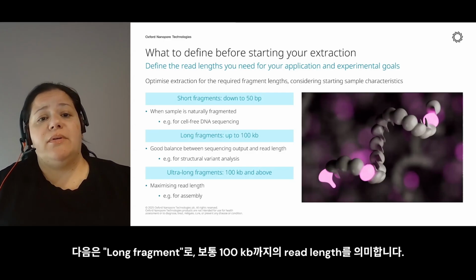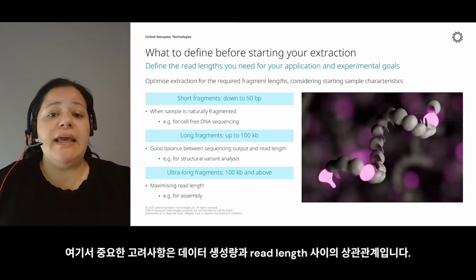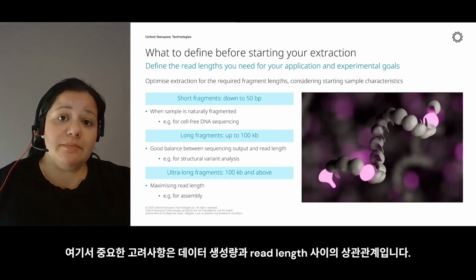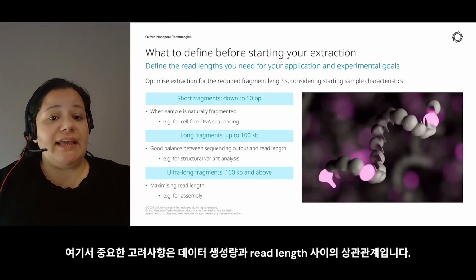And then there are long fragments, so things up to 100 kb. An important consideration is that there is a trade-off between maximizing output and maximizing read length in sequencing.